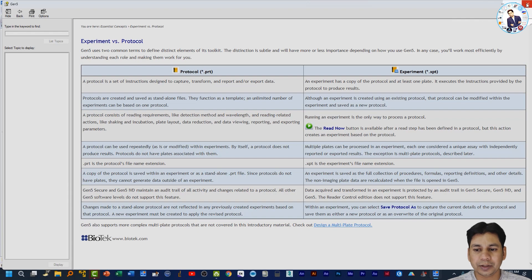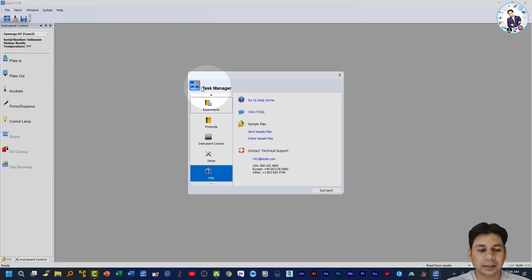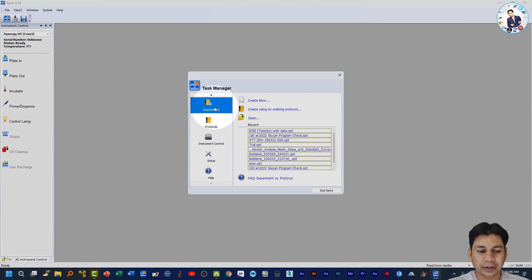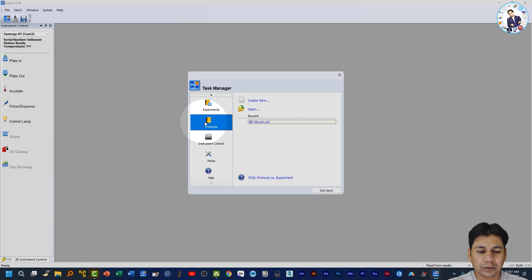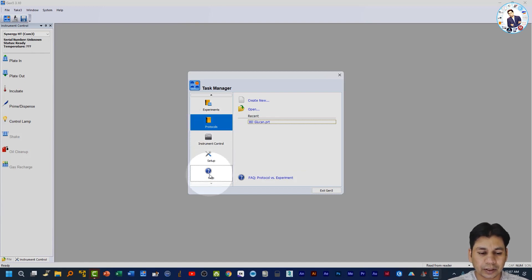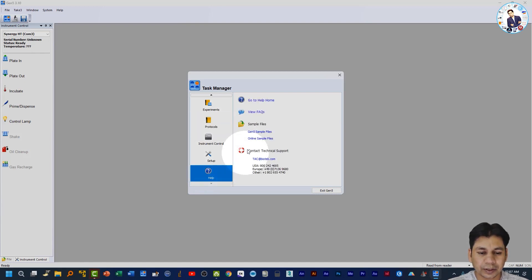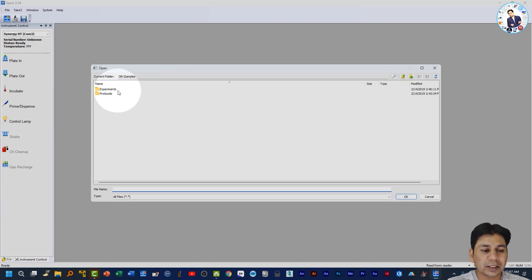Now I'm going to show you in the software. In the Task Manager you can see the Experiment and Protocol folders. If you click on Experiment you can see recent experiments and also protocols. I suggest you click on Help and then click on 'Gen 5 Sample Files.'